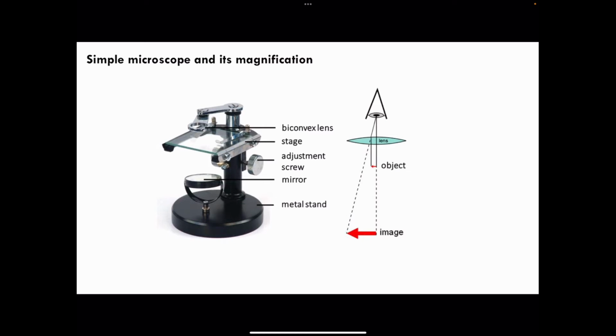Now, model organisms like Drosophila embryo or C. elegans are ideal to be dissected under these simple microscopes that you would see a decade ago. However, this has become much less common in these labs, because they have started to use a compound microscope, which has many lenses in it and is a complicated system, because it's more commercialized right now. Okay, a simple microscope is basically something which you are seeing on the screen.